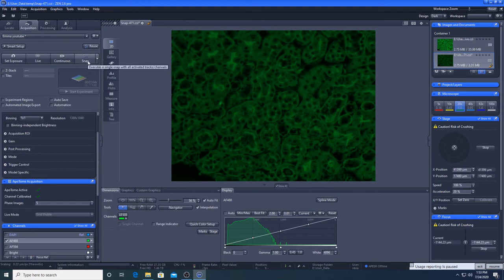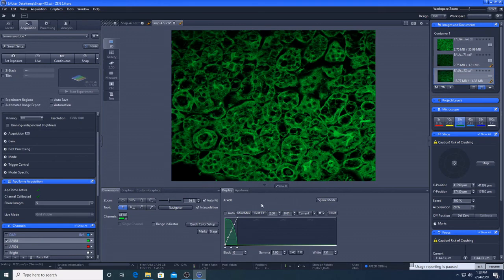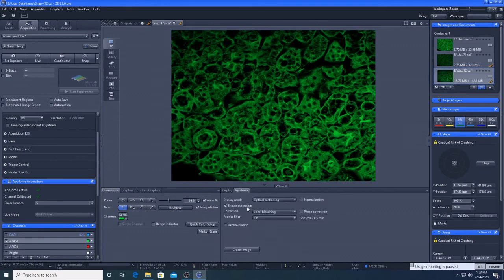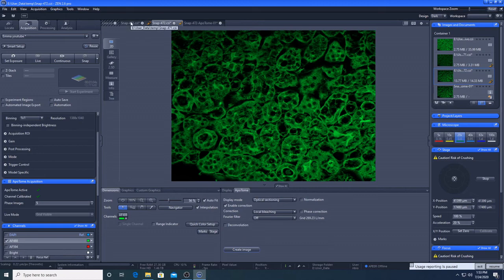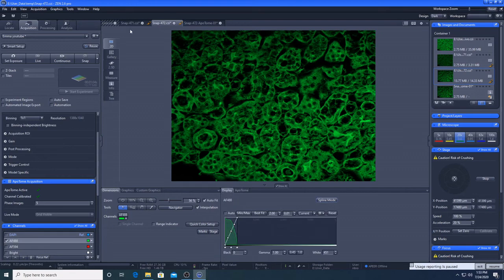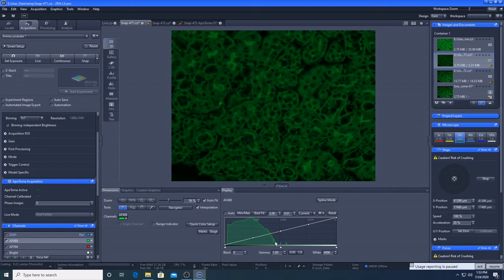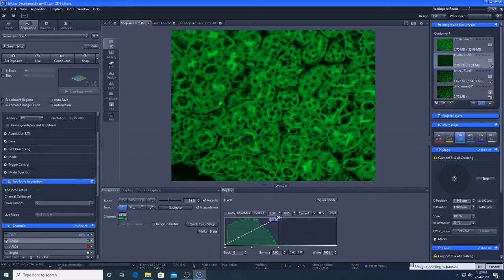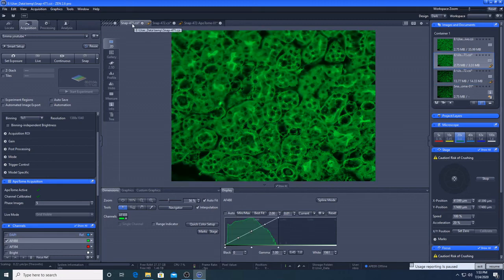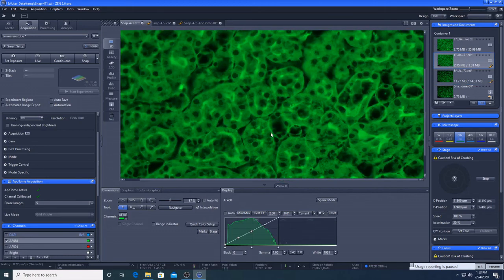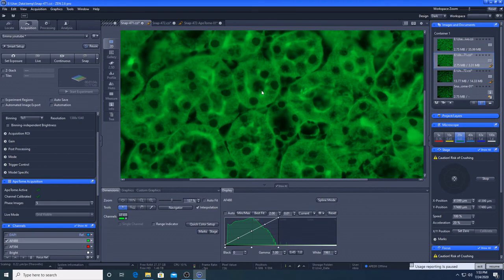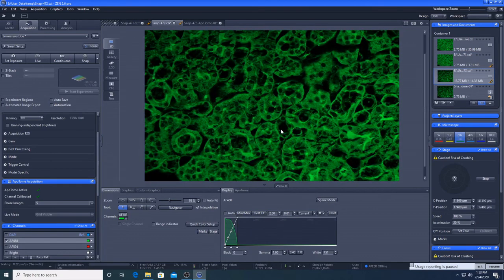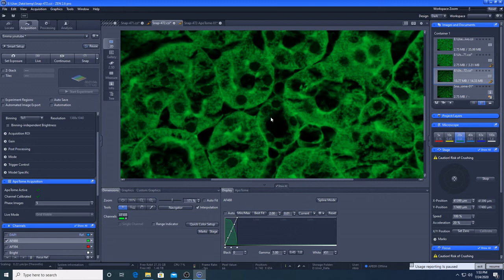Come down to the Apotome menu here. So the default number of images that it takes is five and that's fine. I'm just going to take a snap with the Apotome and I'll go to the Apotome menu here, create image, stick them all together and you can see the difference that that gives us here.